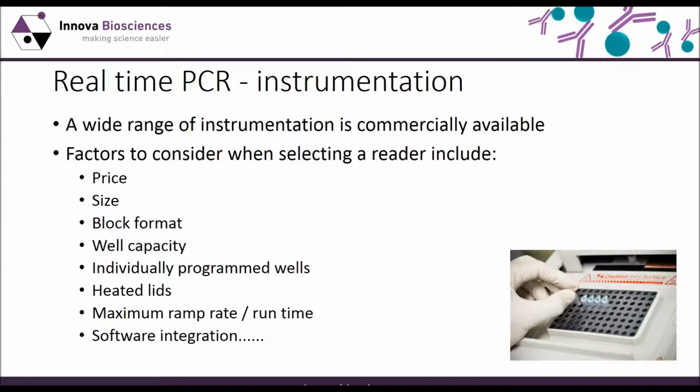Many instruments are provided with heated lids to prevent sample evaporation. The maximum ramp rate should also be considered. This is the maximum rate at which the heating block can change temperature. Faster ramp rates are more desirable, since they will considerably shorten the length of the entire PCR protocol. The instrument software should also be evaluated for user-friendliness, as well as for whether it can be integrated easily with other software or data handling packages which are in use in the laboratory.